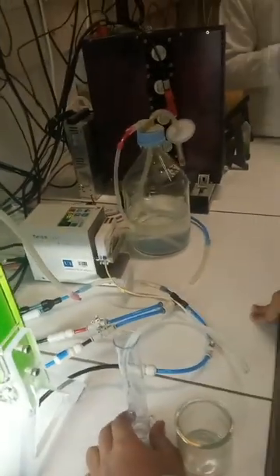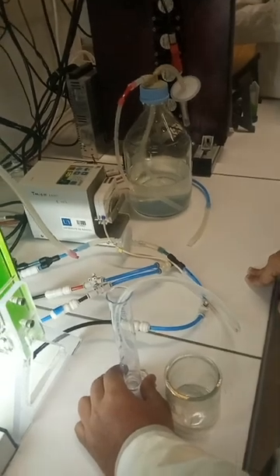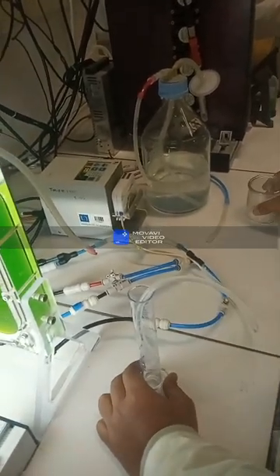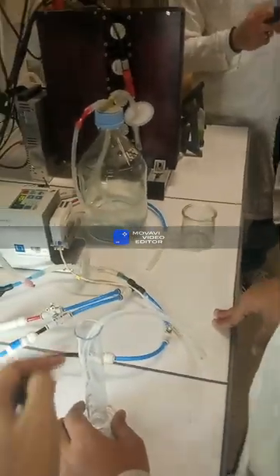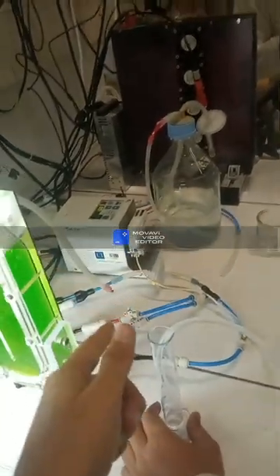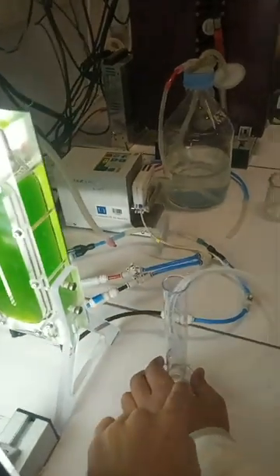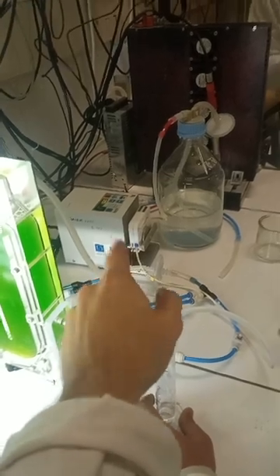Up to how much quantity should I allow this flow meter to flow its liquid? Like 1 ml, 2 ml, up to how much time should I allow it? 1 minute.